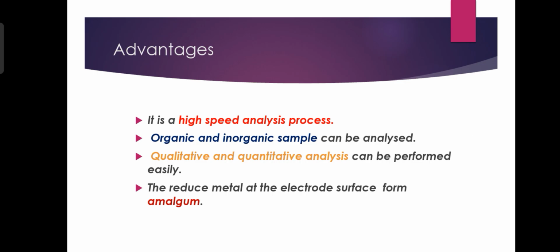And the advantage is that it is a high speed analysis process. It is used for organic and inorganic samples. It can perform qualitative and quantitative analysis, and the reduced metal at the electrode surface can form an amalgam.